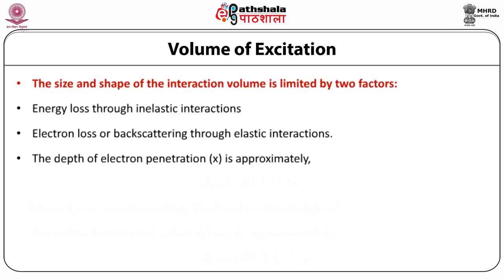Depth of penetration for an electron beam and the interaction volume of the sample are functions of the angle of incidence, magnitude of current, the accelerating voltage, and average atomic number of the sample. Electron penetration generally ranges from 1 to 5 micrometers, with the beam incident perpendicular to the sample.